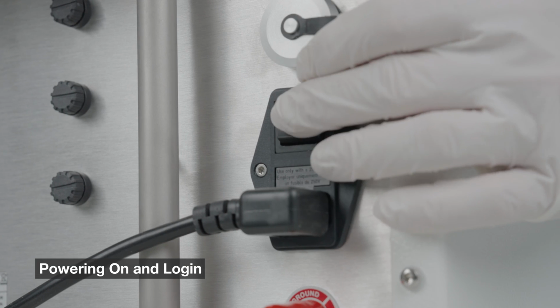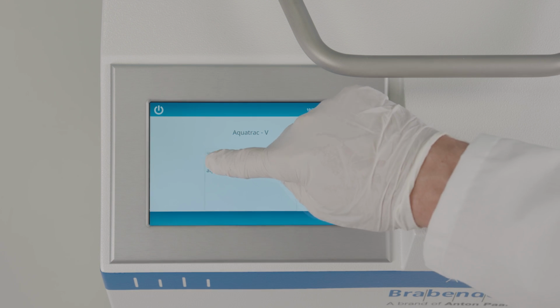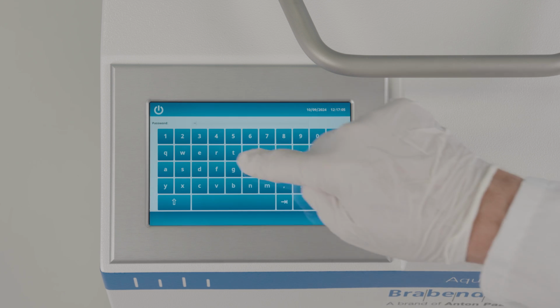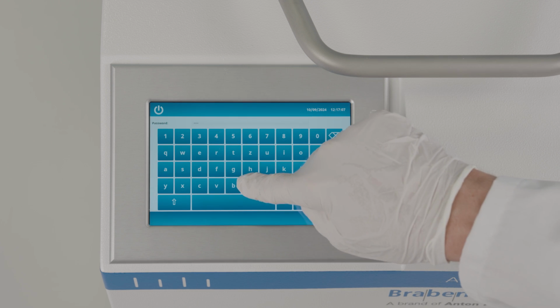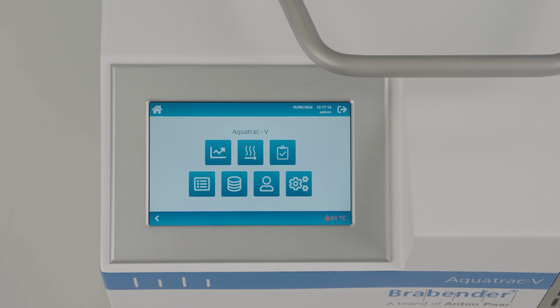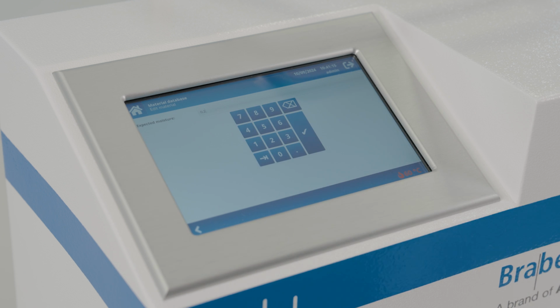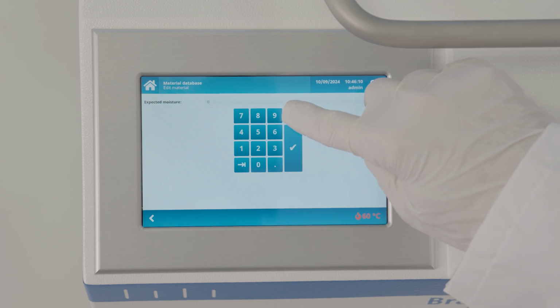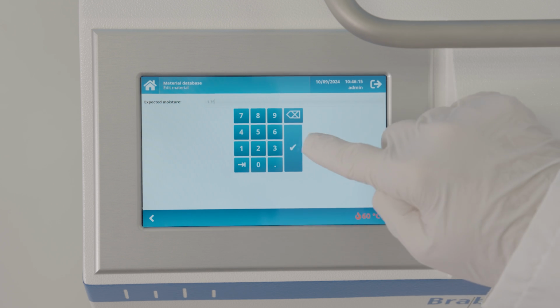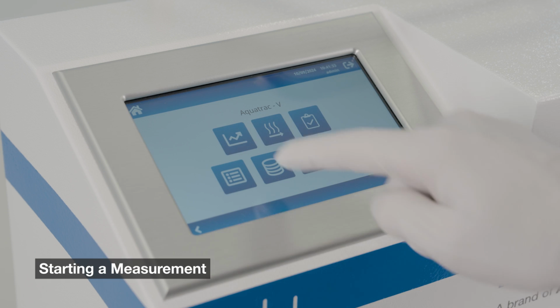Switch on the Aquatrac. Log in using your username and password. Before using a material for the first time, choose the material database. Select the material. Enter the estimated moisture value. Save the data. Return to the dashboard by tapping on the house symbol.